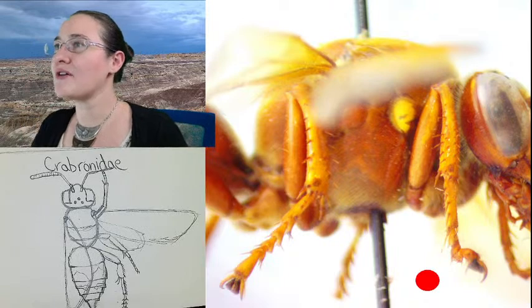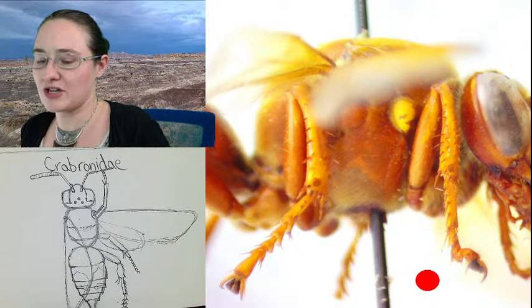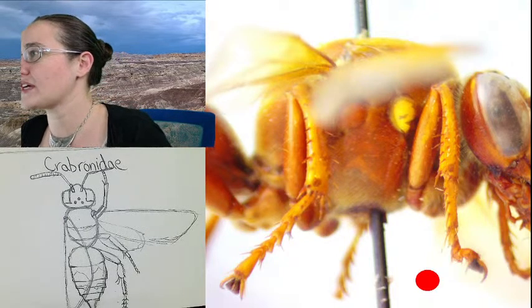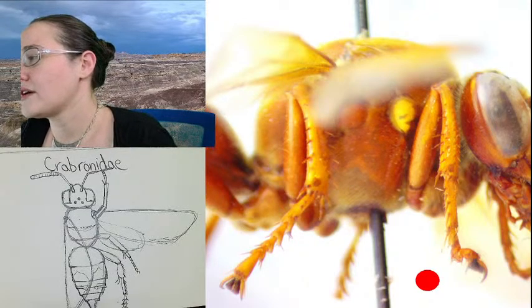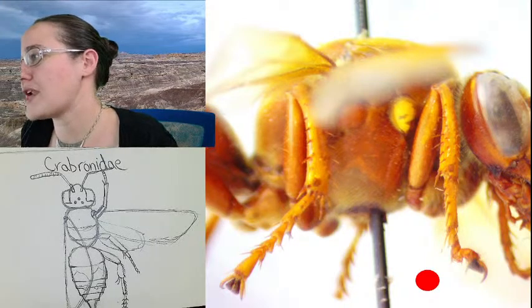All right, so that's going to be our cicada killer. She does have a couple of cool characteristics. Okay, so that's a character of the Sphecids: the pronotum being lobed and not touching the tegula.